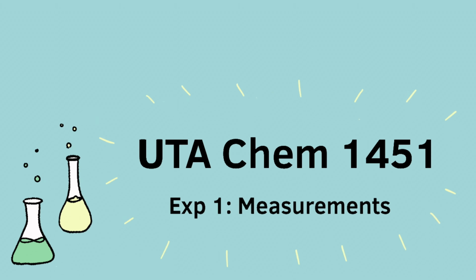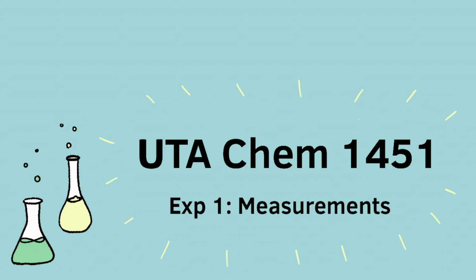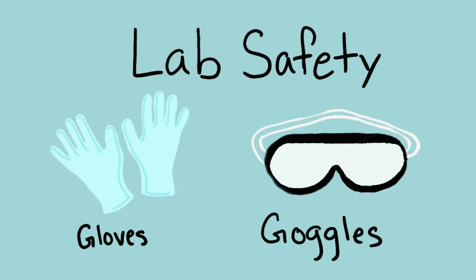Welcome to Chemistry 1451's lab. This week's lab is about measurements and how to accurately measure things using different lab equipment. But before we start, we will need our lab safety equipment, which is the gloves and our goggles that we have to have on all the time.